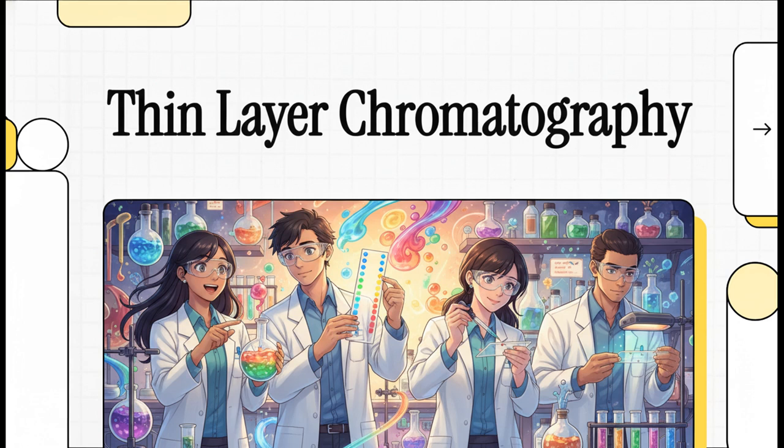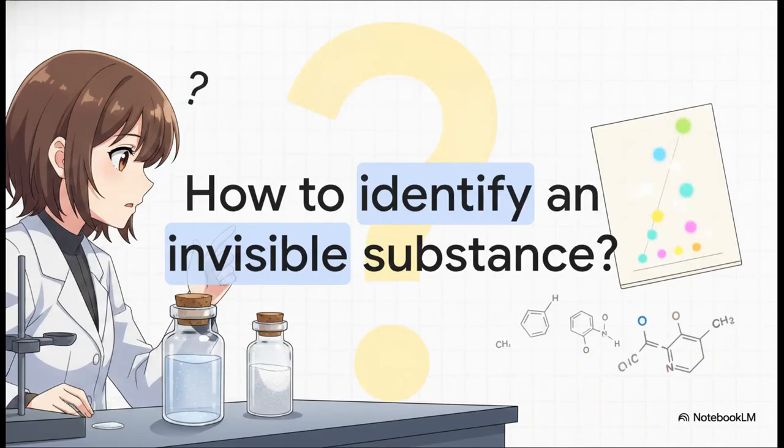thin layer chromatography. So, imagine you're standing in a laboratory. On the bench right in front of you is a tiny vial containing a clear liquid, or maybe a white powder dissolved into a solution. It looks exactly like water. Actually, it looks exactly like 1,000 other chemicals. You can't safely smell it, you definitely cannot taste it, and just looking at it tells you absolutely nothing. You have zero clues to go on. So, how do we figure out its true identity? How do we literally separate and identify the invisible?